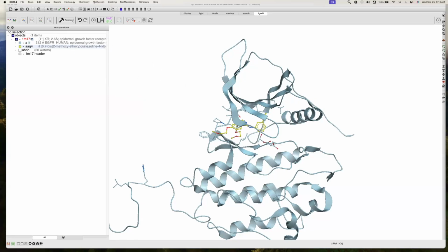Later in the series, we'll be using the docking menu. This gives additional tools for virtual screening and other docking procedures. The ligand editor is more designed for small scale docking and optimization and interactive modeling. So our first step is to tell ICM which we have, these 2 buttons at the beginning.